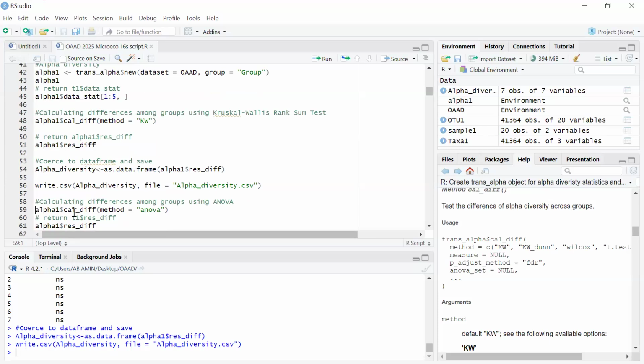If there is anywhere you need clarification, please my attention can be called. Doctor, let me interrupt. I think if we go like this, people might not be able to follow. So I think we should just share the data sets and the screen so that people can also be doing it and getting the result. I think it will be better, so that it will be a really practical session.